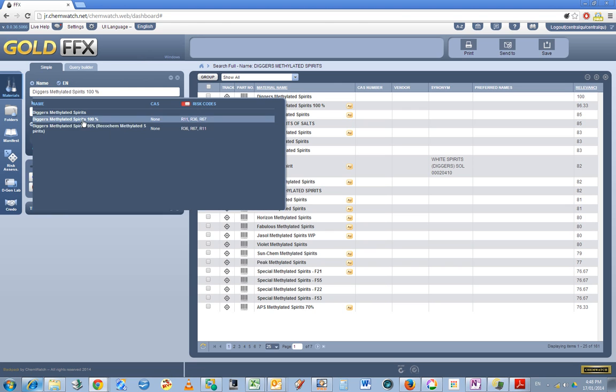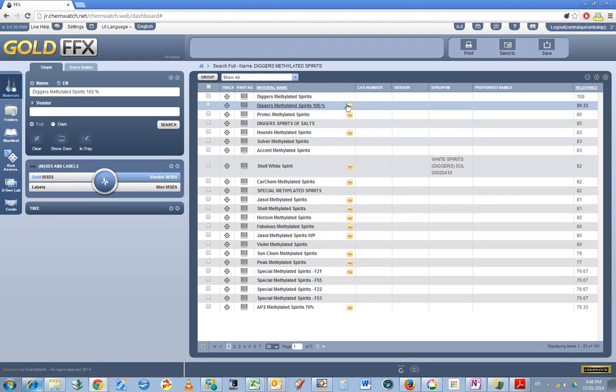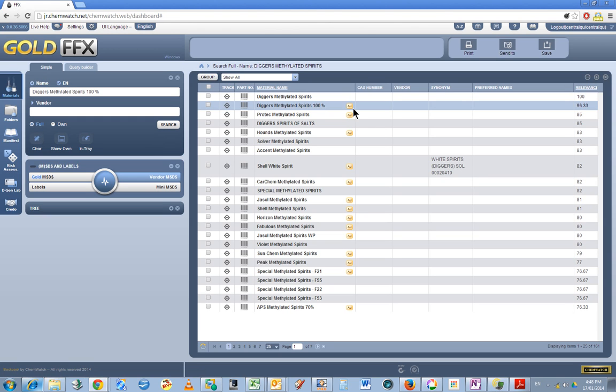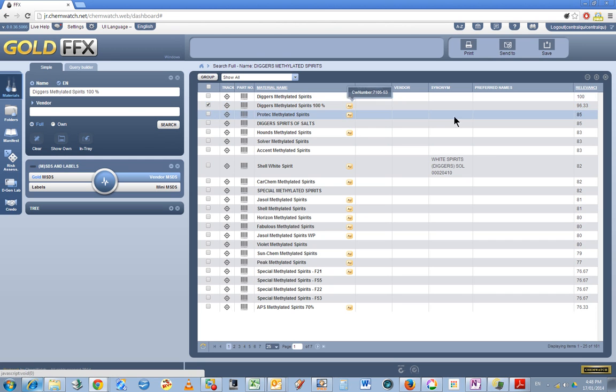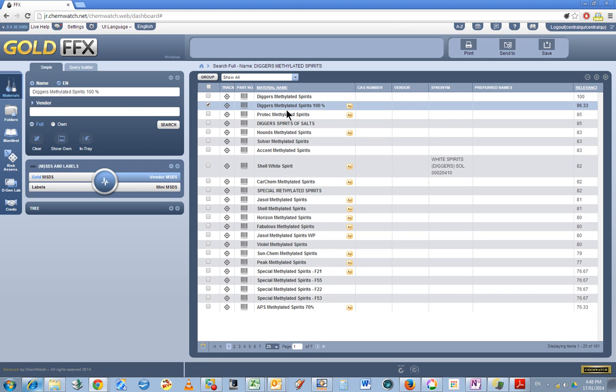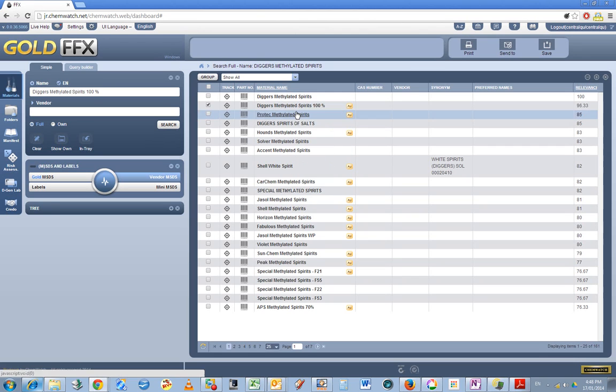So I want this one and you can see it's listed here as AU—I think that might be Australian, I'm not sure. So I tick the little box here and right-click on it and just go copy.